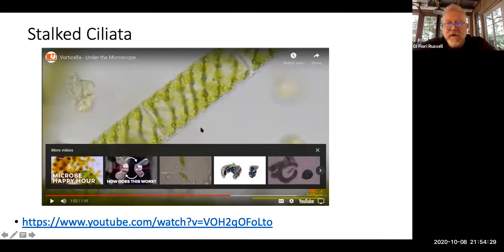Anyway, I didn't want to bore you with the entire video. The Vorticella, you can see here, that's a Spirogyra, single-celled or filamentous green algae. The Vorticella can be bigger than this. They can be a little bit larger even than the green algae you see, but they always have these stalks that they're attached with. And you'll see other stalked ciliates that attach to the surface of things.